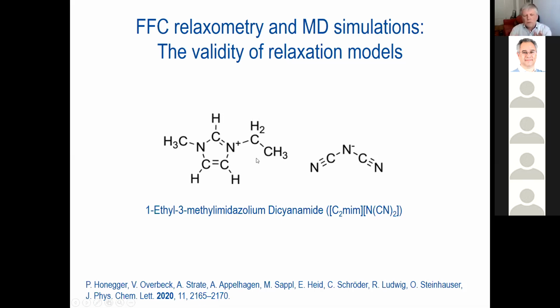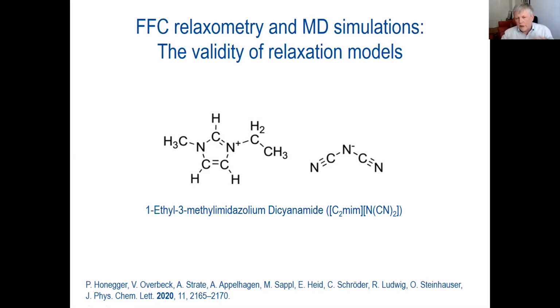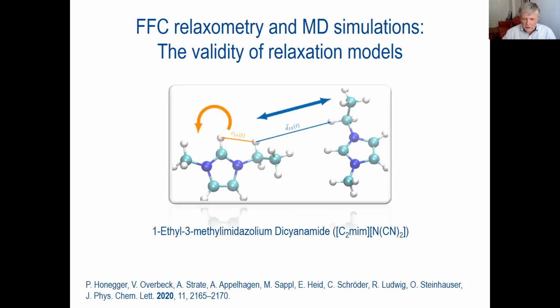So that was not a very interesting system, but we only want to show whether the model assumptions we are making are fine and justified compared to the simulations, right? Because you can calculate all the properties in your simulations and can finally simulate the relaxation rates and the dispersion curves, and you can compare them directly with what you measure. And then you have nice molecular insight. You get reliable coupling parameters, diffusion coefficients, as well as correlation times, right?